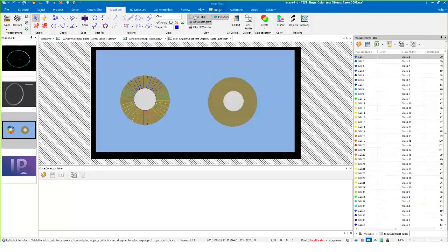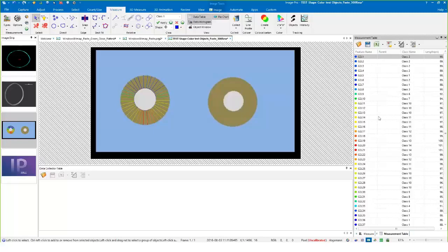As always, we can also see it in a data table like this and look at summary statistics or group them. There's a lot of ways to view this.